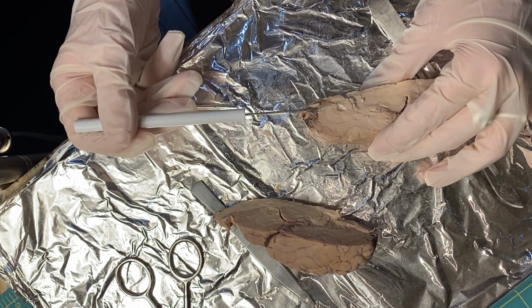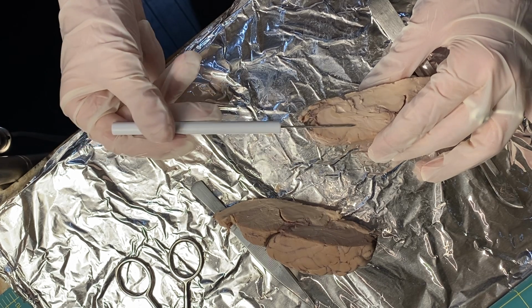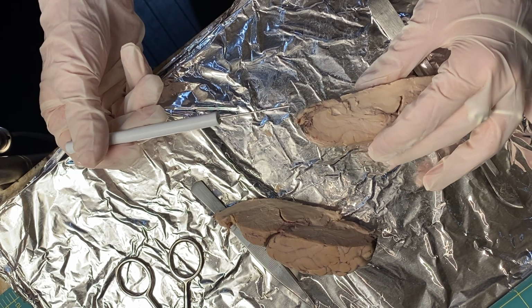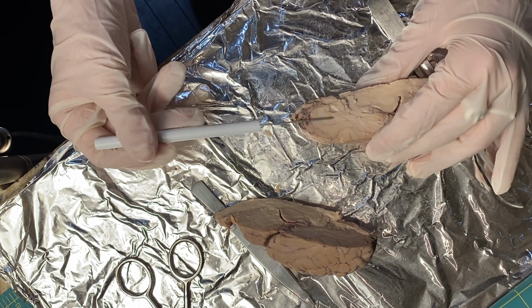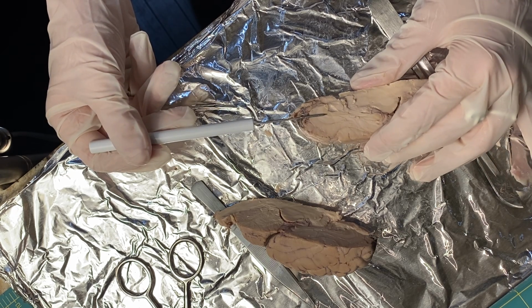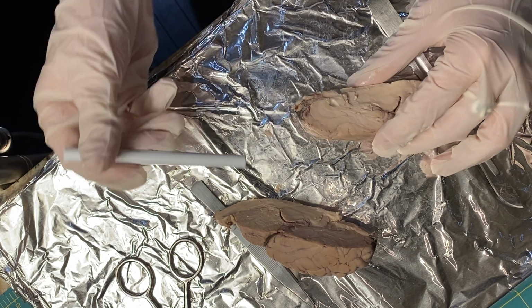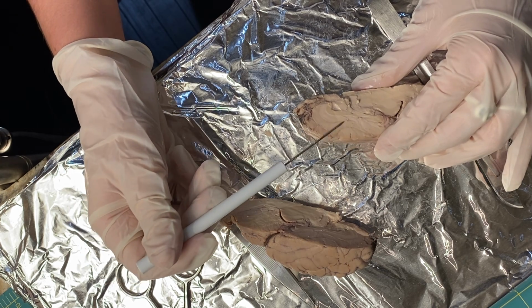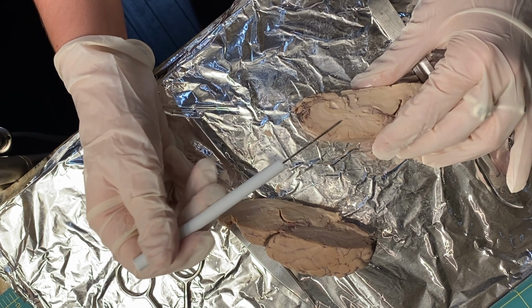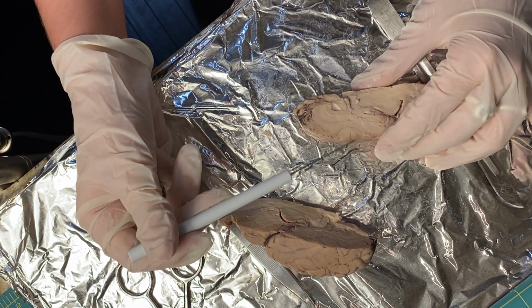starting over here, we have the hippocampus. So the hippocampus is responsible for converting short-term memory to long-term memory. We've got the cerebrum right here. So for the corpus callosum, it's right here. It connects the right and left brain hemispheres.